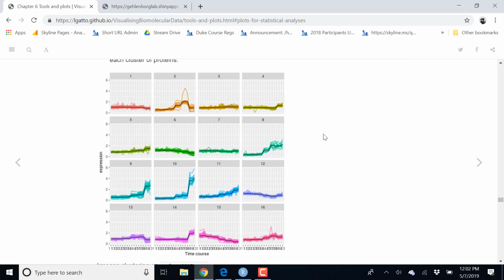Maybe here we have a slight increase, and here a slight decrease in the last 3 figures. But we would like to see what kind of patterns we have in this temporal gene expression figure. Here we have upregulation at the end, but not very much happening during the time course, and then it goes down. So we are trying to identify patterns of gene expression that could be useful afterwards for downstream analysis.